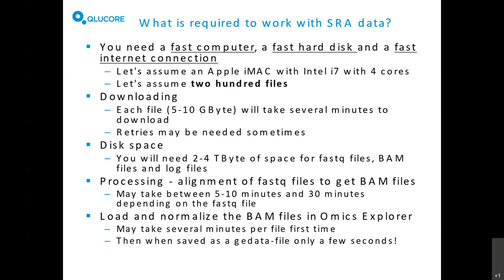Not all projects have 200 files, but just to remind you it could require something like that. Processing may also take time. Files downloaded from the SRA archive are mostly in FASTQ format and need to be aligned, which may take between 5 and 30 minutes depending on how the FASTQ file is organized. Then you need to load and normalize the BAM file in Omics Explorer, which may take several minutes per file the first time, but then you save the data file and the next time you open it in just a few seconds.